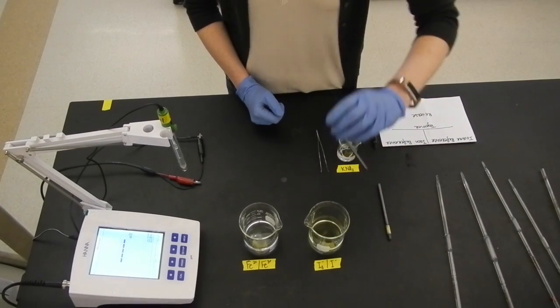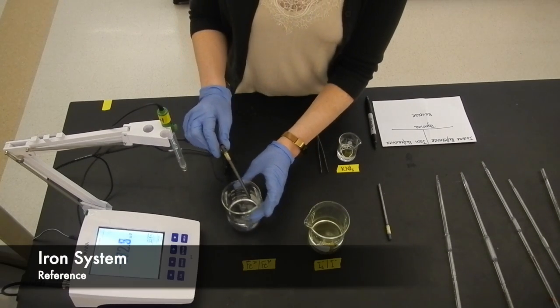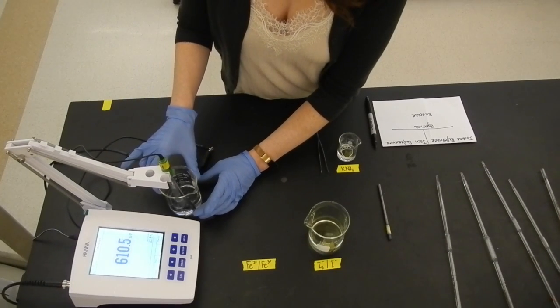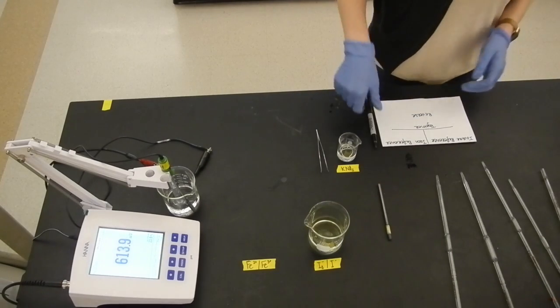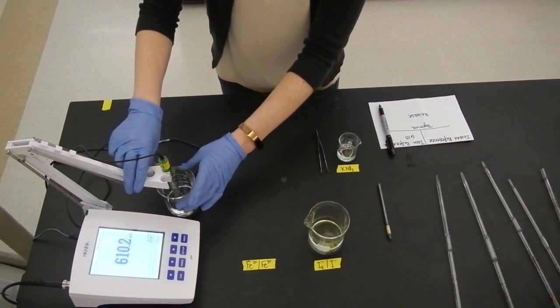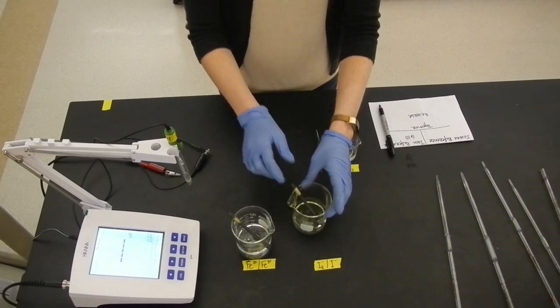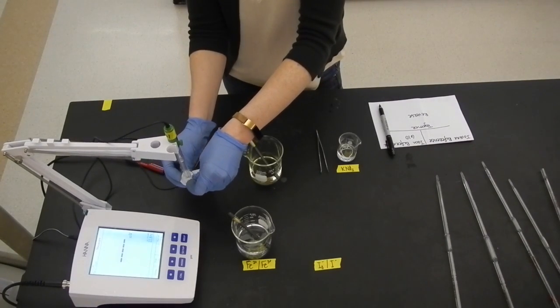Here we have two reaction beakers, one for the iron system and one for the iodine. With the graphite rod, once again, record the millivolt reading for the iron half reaction against the reference electrode. With a second graphite rod, record the millivolt reading for the iodine half reaction against the reference electrode.